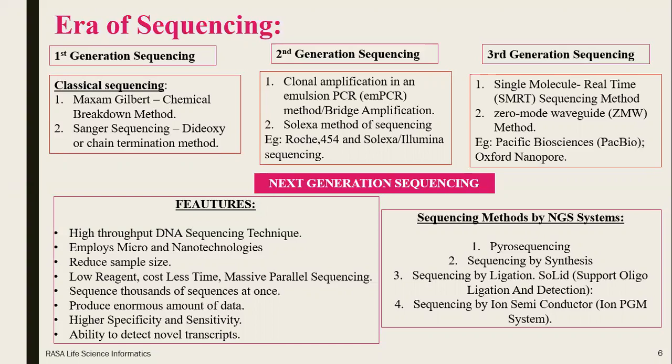If we go to the second generation sequencing, we can see DNA sequencing with parallelized amplification. What happens is that the DNA molecule is clonally amplified in an emulsion PCR. Adapter ligation and PCR produce DNA libraries with appropriate 5' and 3' ends, which can then be made single-stranded and immobilized onto individual suitably oligonucleotide-tagged microbeads.